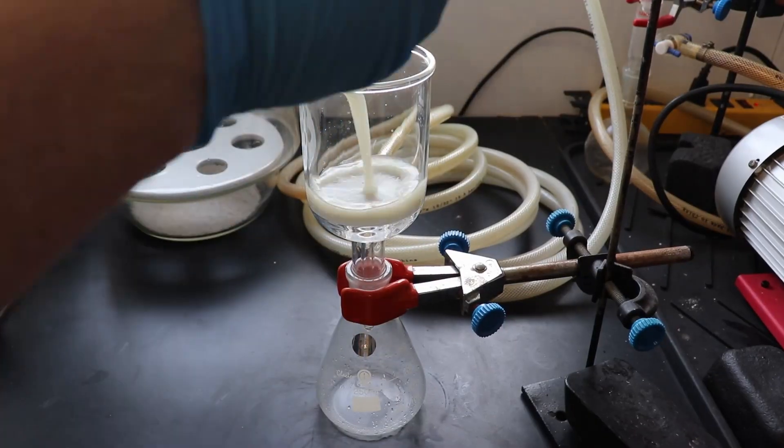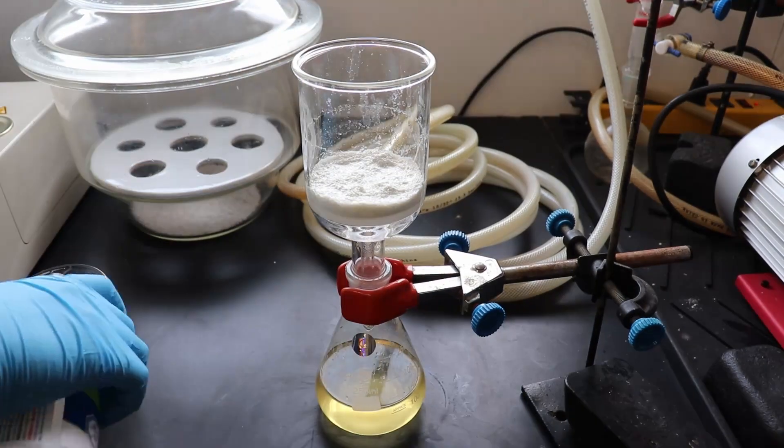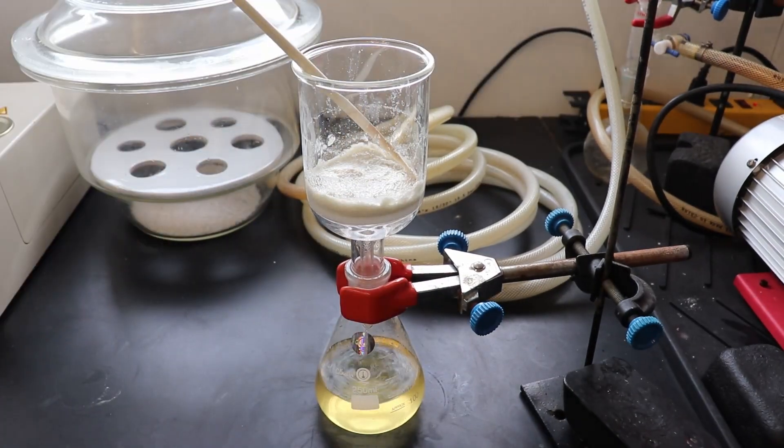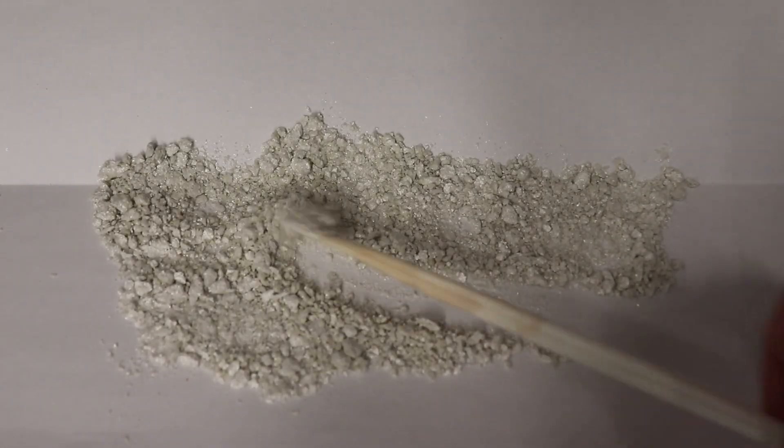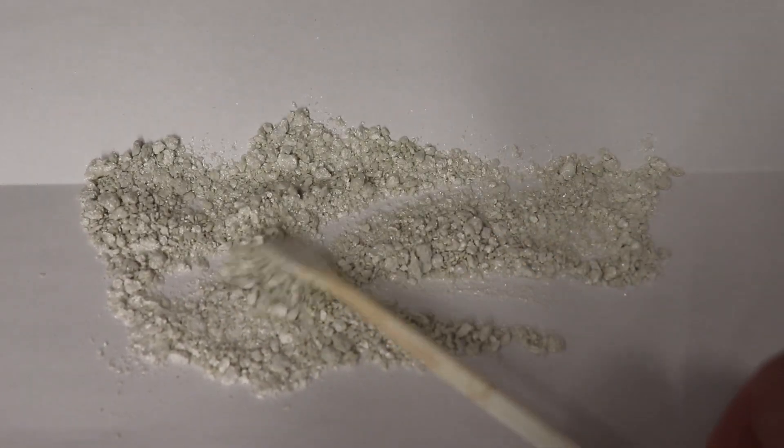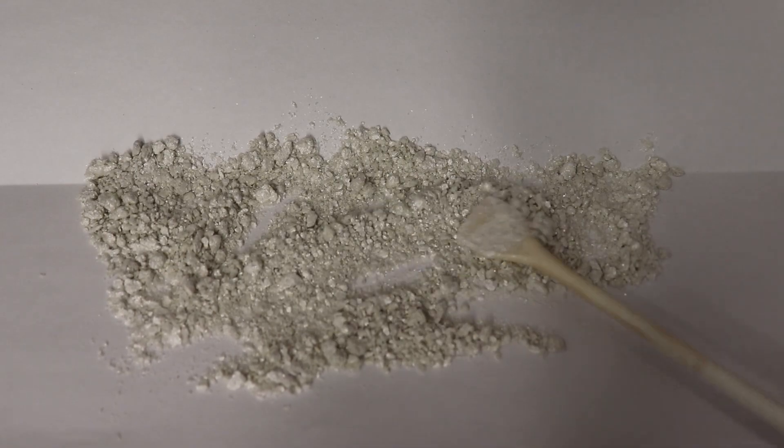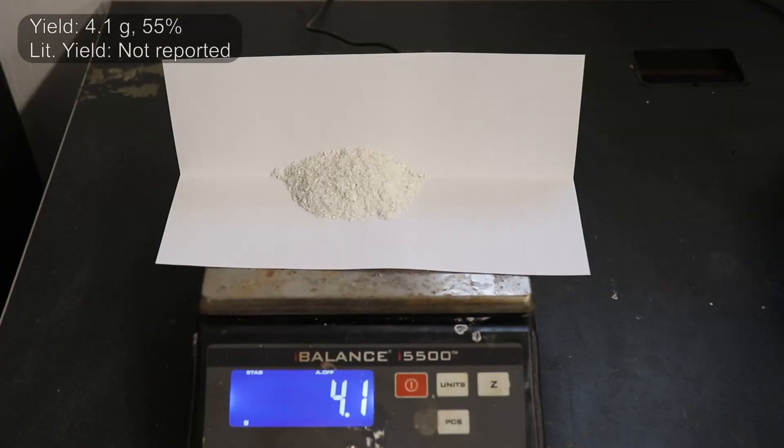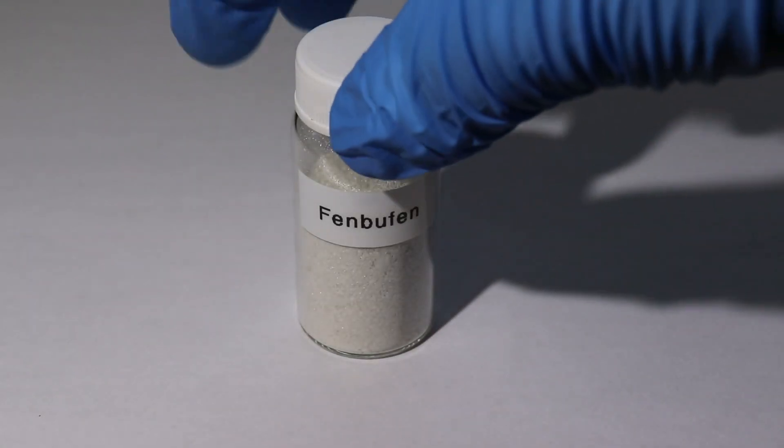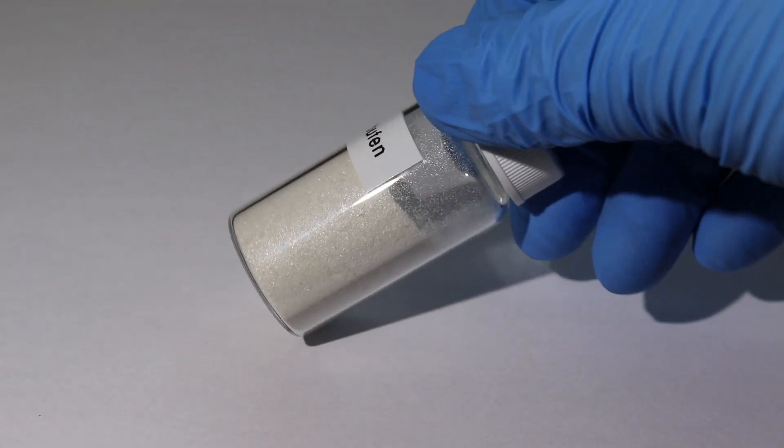I then cooled down the beaker in the freezer to fully precipitate out the product, filtered it off, and then washed with a little chilled ethanol. I ended up with 4.1 grams of a white crystalline powder, which corresponds to a 55% yield, but unfortunately there was no reported yield for the literature procedure I was following, so I can't really make a comparison there.